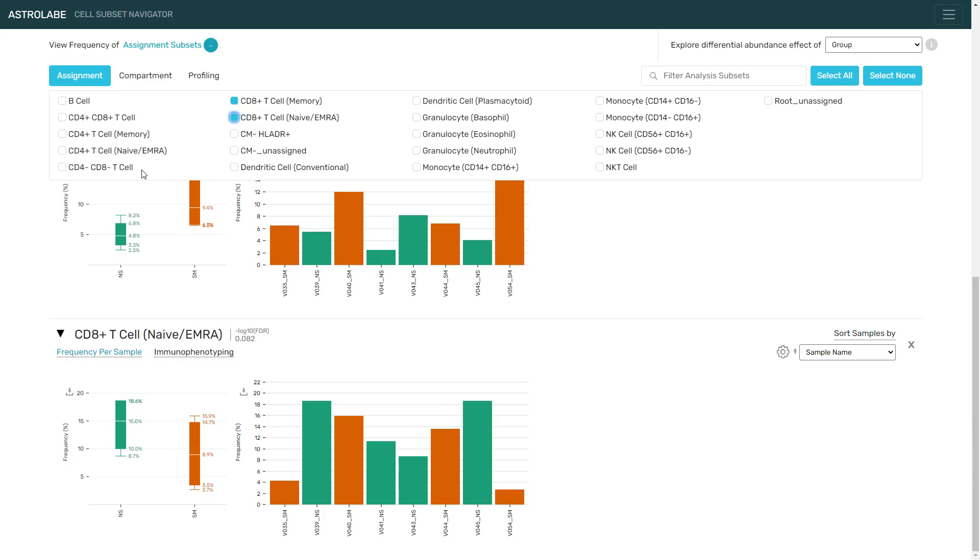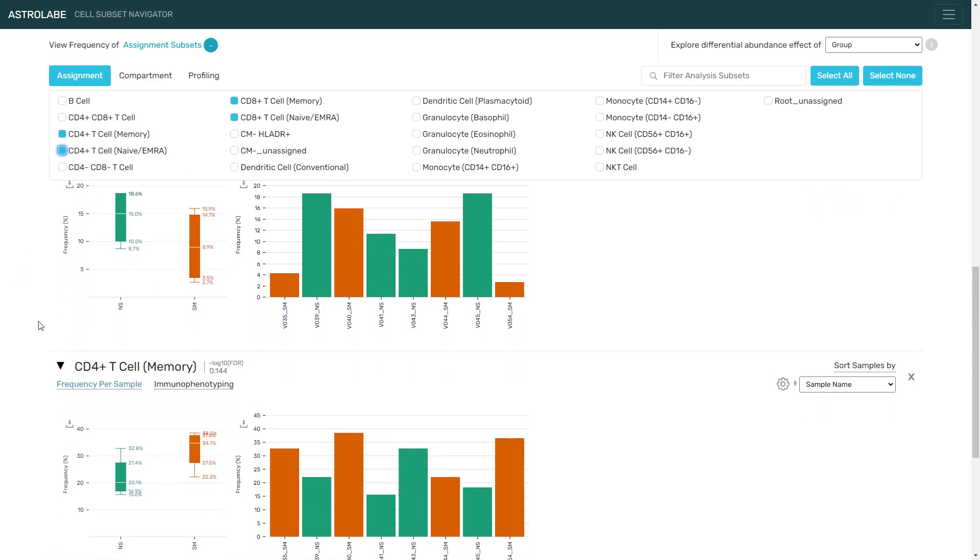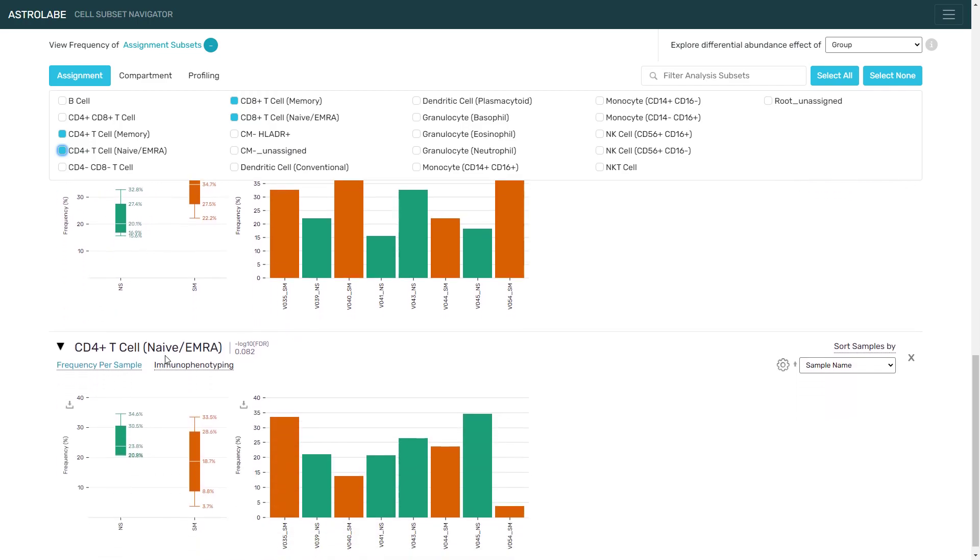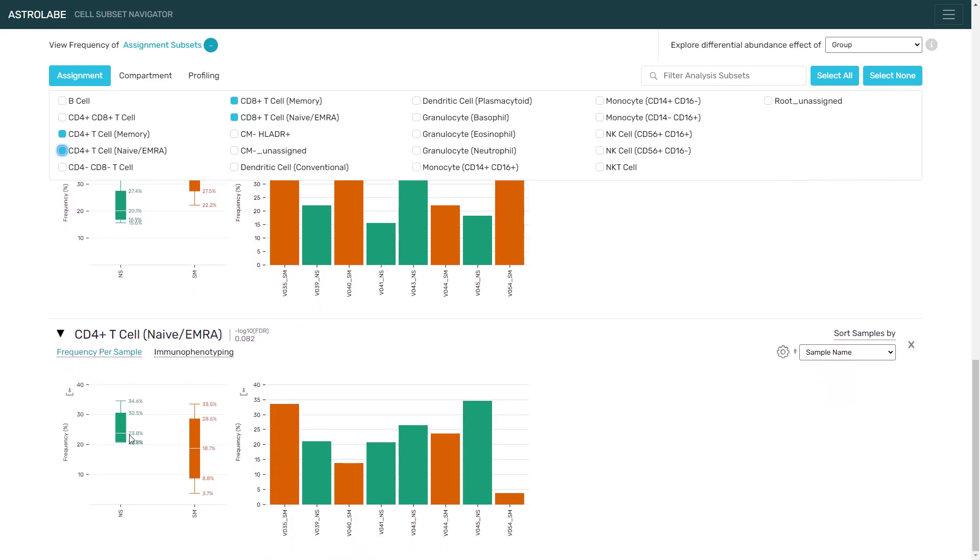Let's add the CD4 T cells to the analysis as well, and we're going to see a similar change. There is an increase in the memory compartment. There is a decrease in the frequency of the naive and the EMRA cells.